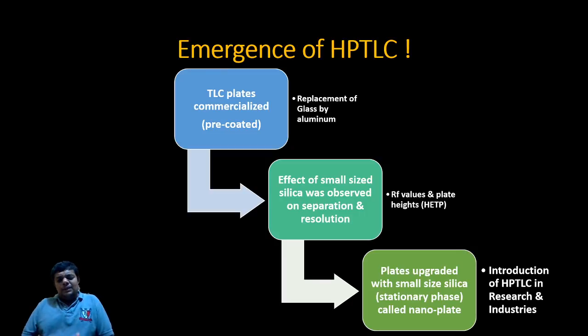Friends, after the mobilization of the TLC technique and its practice among the researchers and the industrialists, TLC plates became commercialized. How? The glass which was used as a support on which silica was stuck got replaced by aluminum plates.